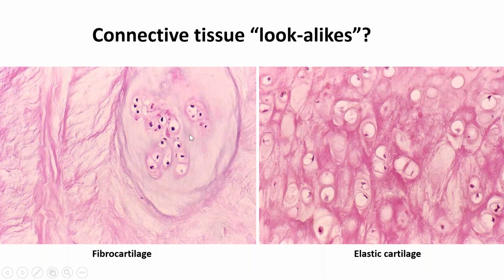And this is from an intervertebral disc, a human intervertebral disc. And if we note, there's not many cells in this particular tissue compared to the other types of cartilage that we saw. A lot of times in fibrocartilage, the cells are going to be single, or they're in maybe a small cluster or maybe rows. So I thought this was a nice presentation.